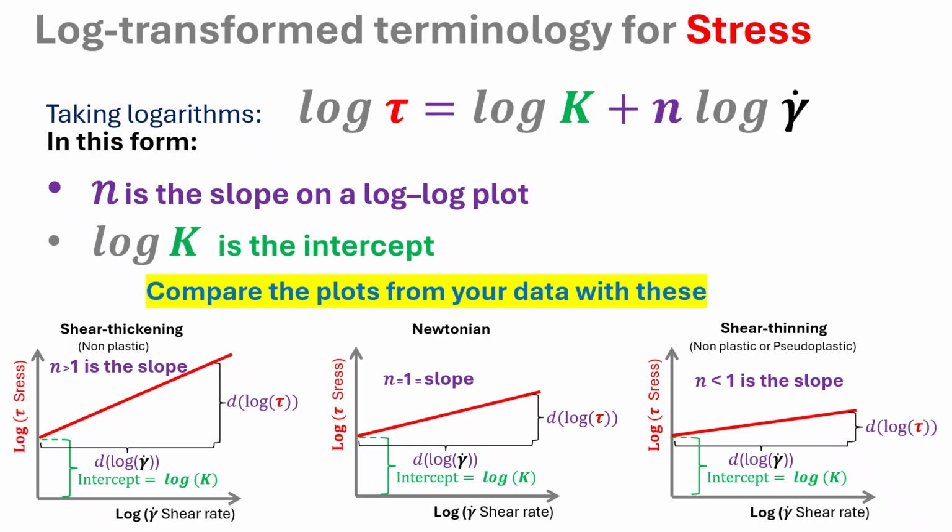One of the things I've tried to show in all of the data is the log-log plots for shear stress and for viscosity. The reason for that is that the slope of the straight line that you should get is equal to this flow index, the n value, or indices value.